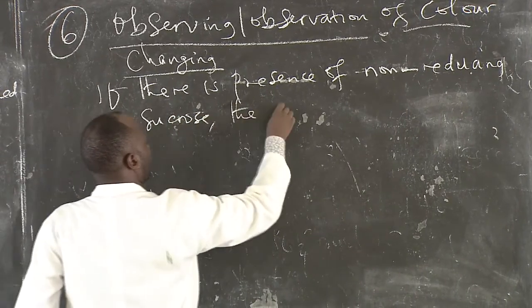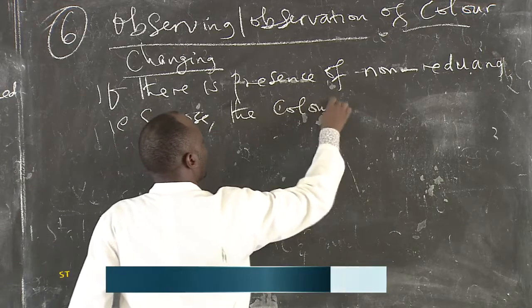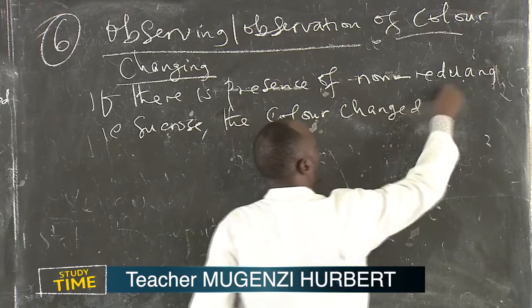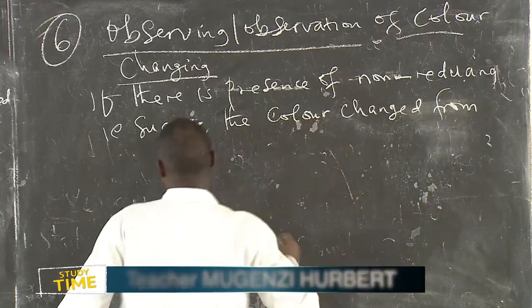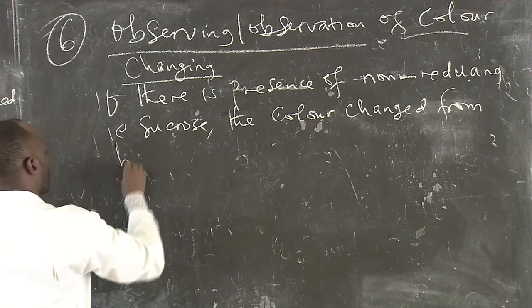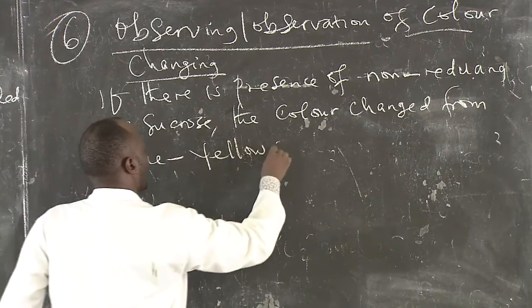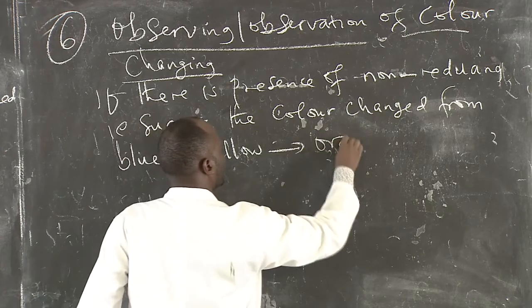The color changed from blue to yellow, then finally to orange.